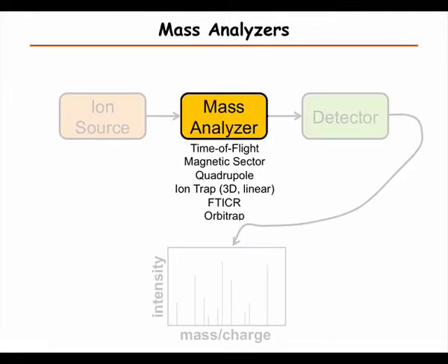So then mass analyzers: there are quite a lot of different ones, and people have also combined them in different ways. What are the relative pros and cons between the two detectors? Is there one that you use for one specific kind of application? Yes, so it's usually determined by the mass analyzer.